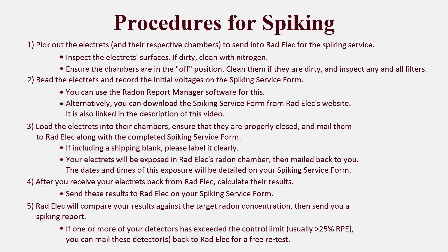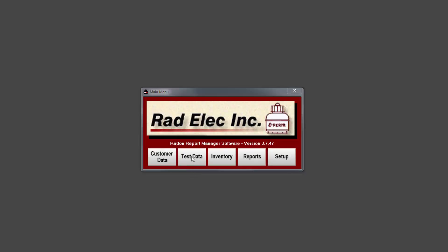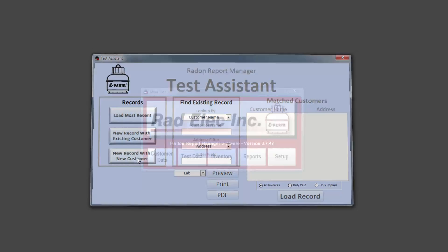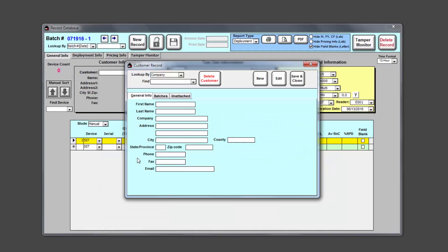The next portion of this tutorial will be focused on taking an in-depth look at each of these five steps. We'll skip step one since it's self-explanatory and instead shoot right to step two, where we'll launch the Radon Report Manager and use it to create a spiking record. From the main menu, click on Test Data and then click on the New Record with New Customer button from within the Test Assistant. We're going to assume this is the first time a spiking test has been created in the database, so I'm going to enter a fictitious company name in the customer window. The purpose is so you can specifically track all QAQC-related records by looking up your own company name.